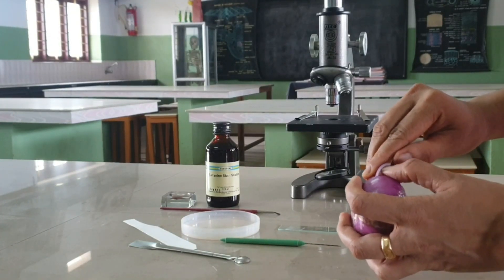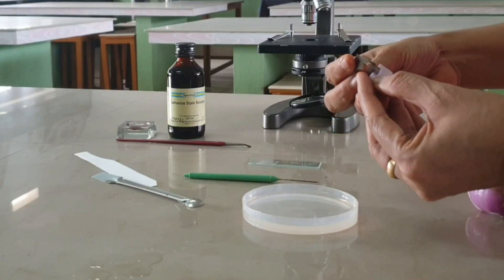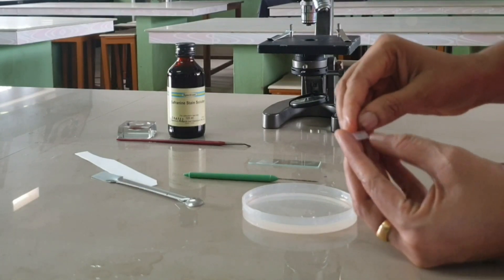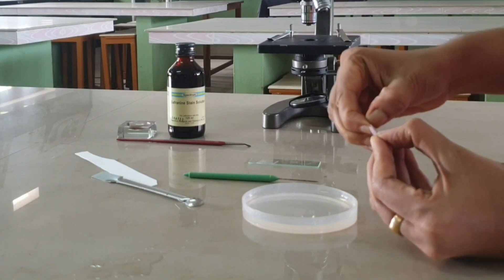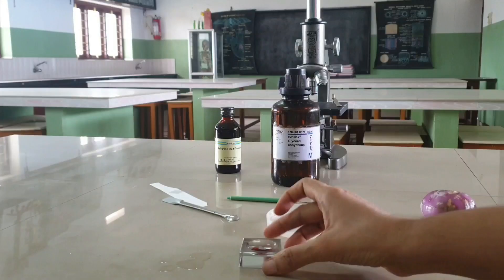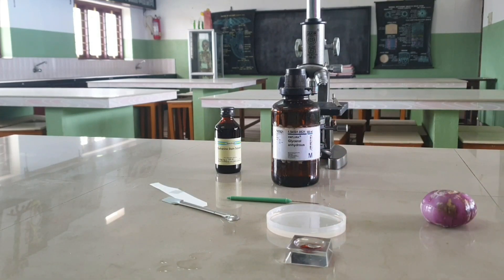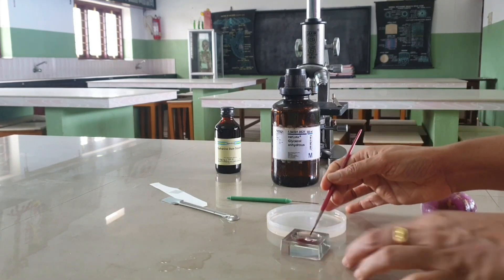Procedure: take a piece of onion and with the help of forceps, gently pull a thin transparent peel from the ventral or inner side. Keep this peel in water in a petri dish or watch glass. Add a few drops of safranin stain in the watch glass to stain the peel. Both over-staining and under-staining should be avoided.